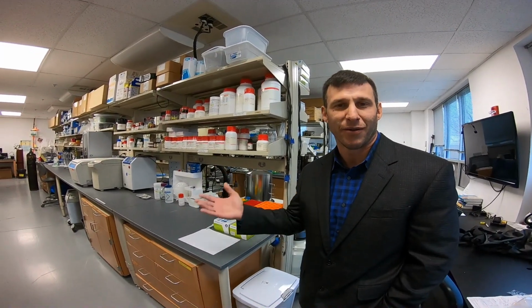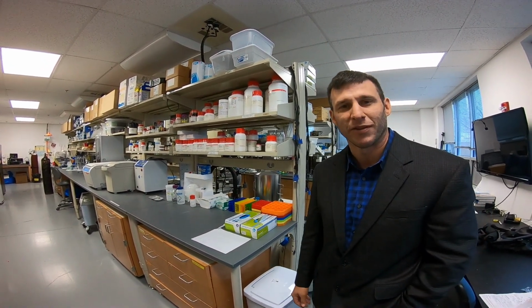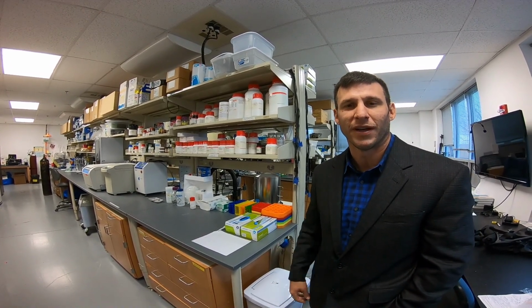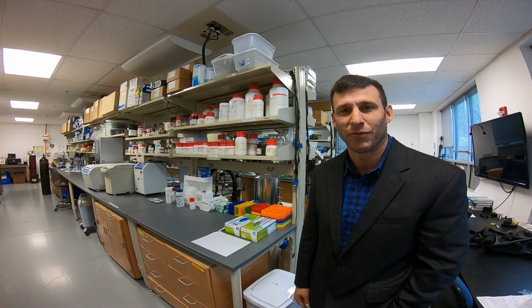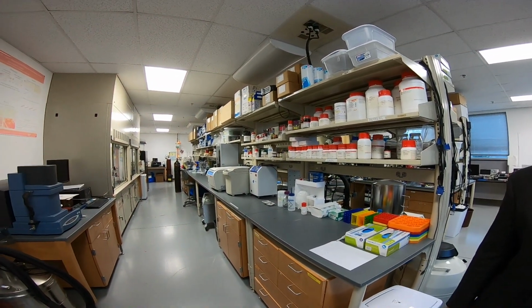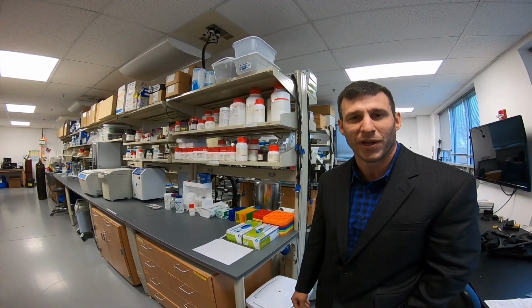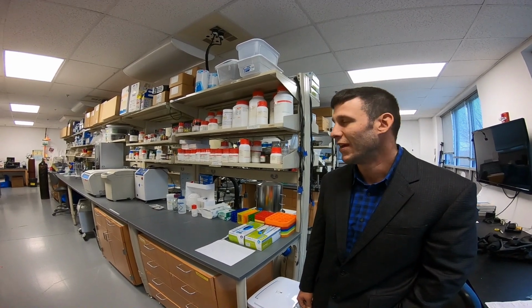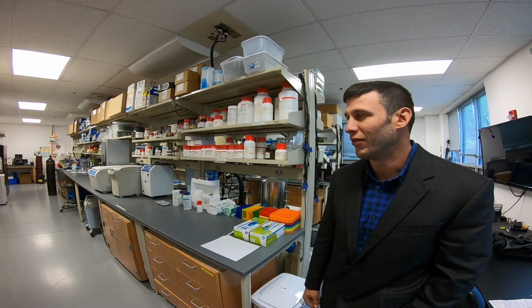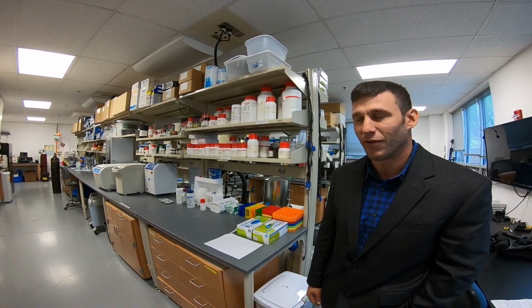So as I mentioned, we're very lucky to have access to a really large lab space and to be able to do all the components that are required to do advanced biomanufacturing and biosensing research. In this section of lab, you can see we have dedicated resources for chemistry and preparing the materials that we use in biomanufacturing and biosensing applications. We have a number of chemical fume hoods that can support students with a chemistry background and doing research that has chemistry incorporated in it, and biochemistry as well.